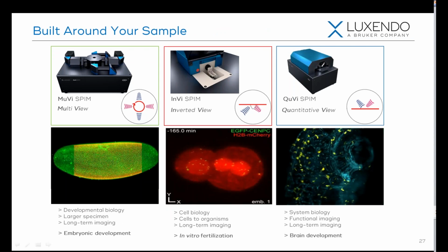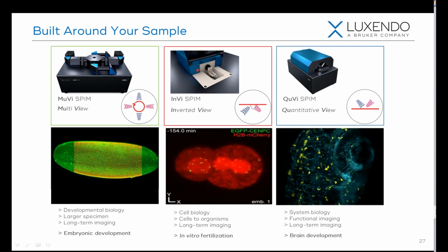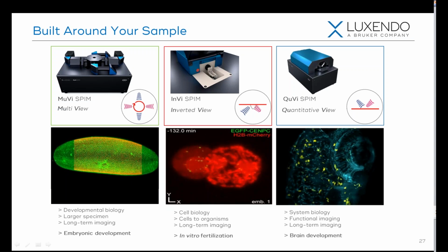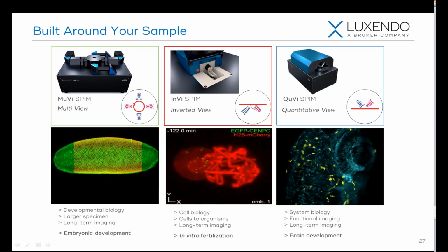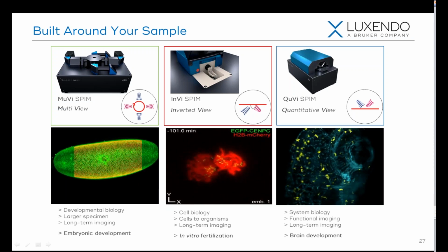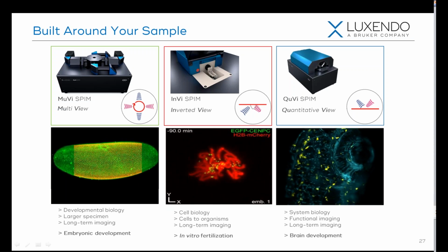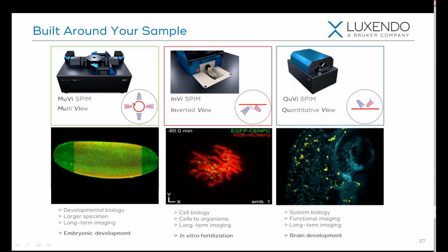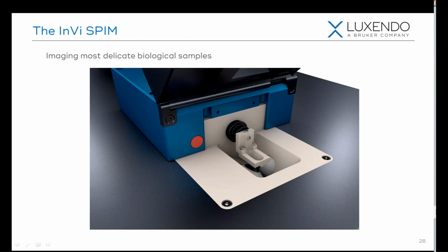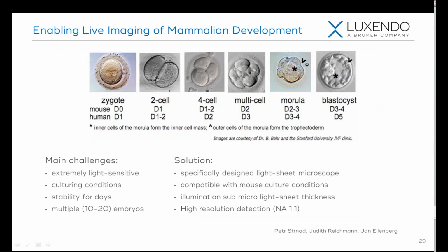Okay. So far, I've introduced you to our multi-view SPIM in the movie. The next one I want to introduce you to is our inverted view SPIM, the INVI. And the INVI has a pretty unique story, because this was really developed for imaging some of the most delicate biological samples out there, that is mammalian embryos.